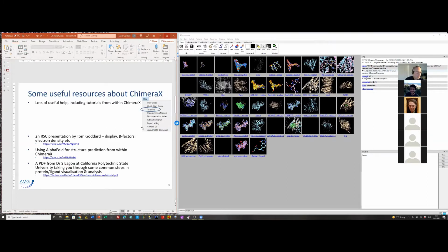Okay, so there's plenty of information about ChimeraX out there. As usual, searching online will provide lots of information. There is also some very useful help inside ChimeraX, which is, I guess, unlike some academic software. In particular, I find the tutorials very useful.